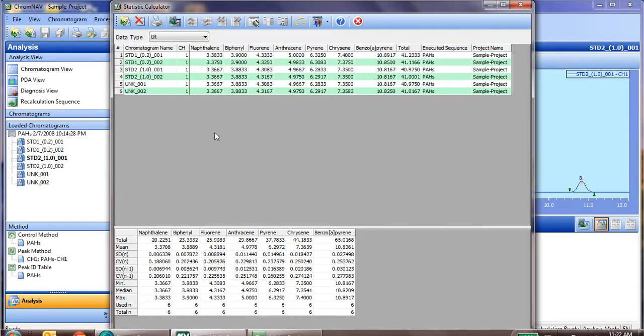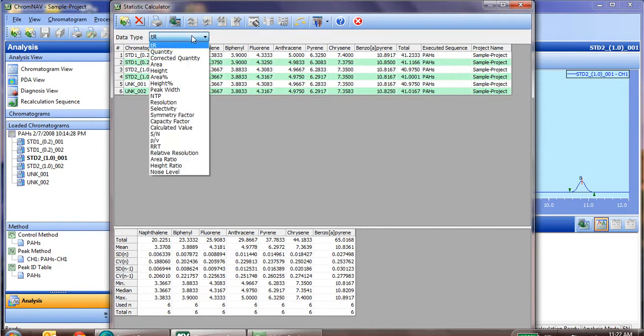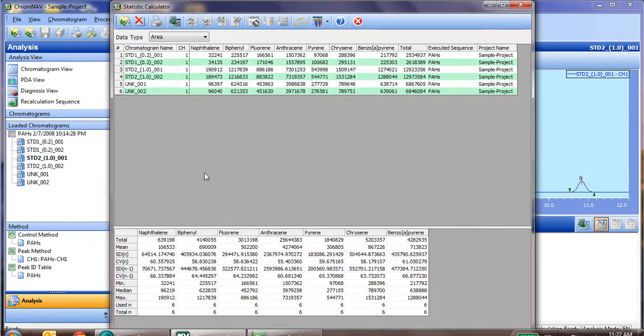Now, of course, for retention time this works, should we go to area, it's not going to work, as currently we have different standards, so different concentrations of each sample.